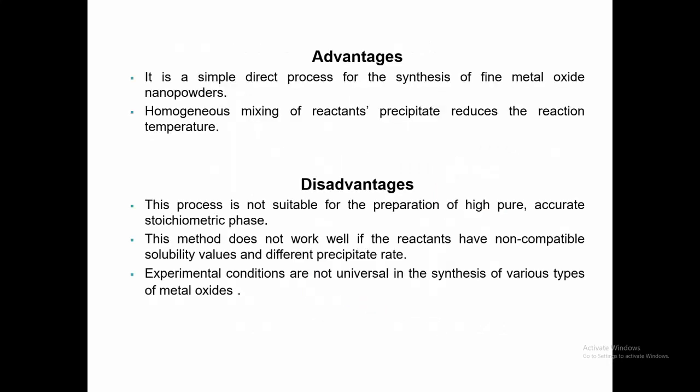This co-precipitation method has some advantages. These advantages are, it is a simple direct process for the synthesis of fine metal oxide nanopowders. Homogeneous mixing of reactants precipitate reduces the reaction temperature.